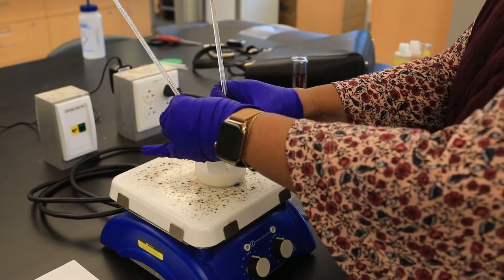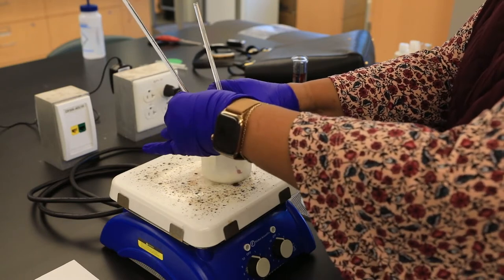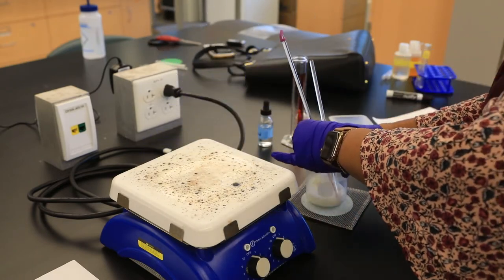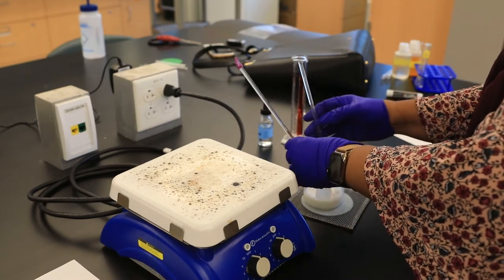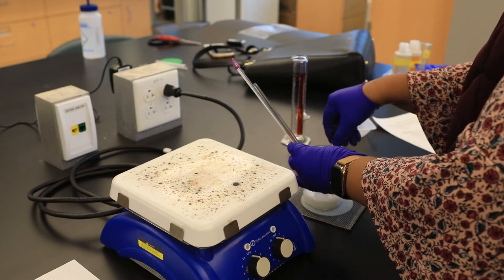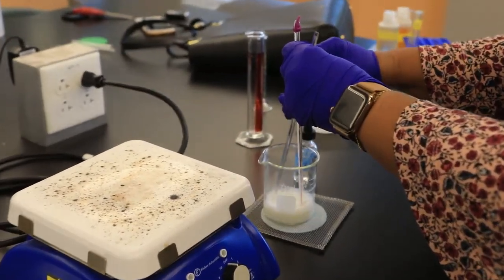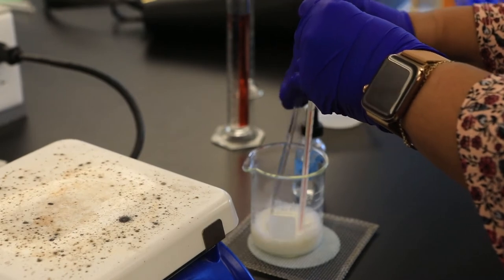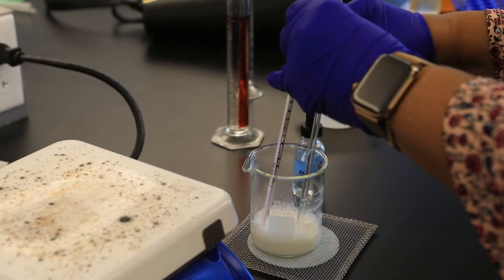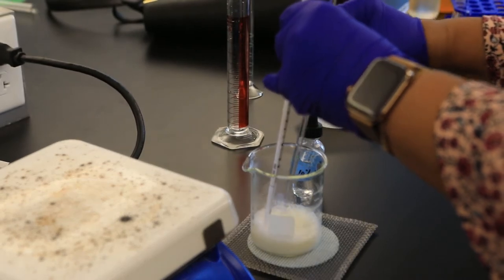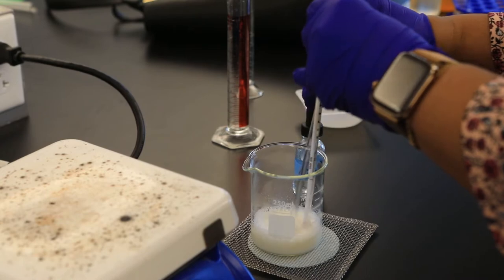Now that our thermometer has reached between 40 and 45 degrees, I'm going to remove it from the hot plate and add acetic acid. The purpose of that acetic acid is to precipitate out casein. As that solid casein is formed, I'm going to move it off to the side in the upper beaker.